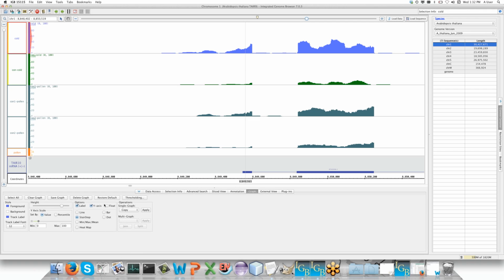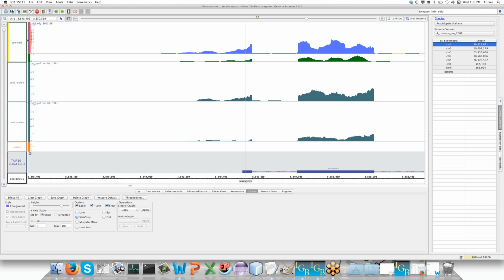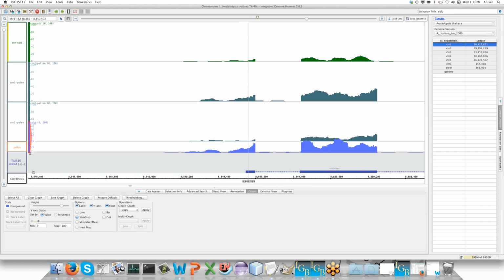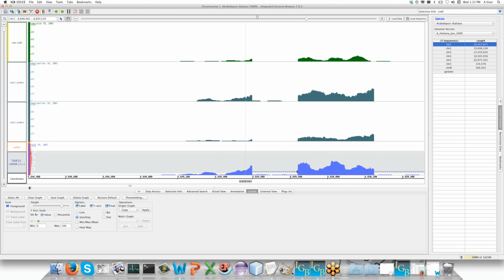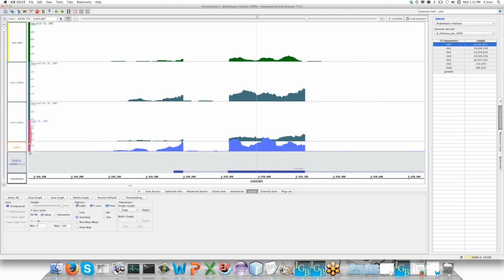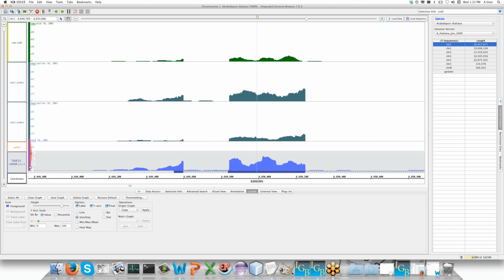We give you in IGB the ability to float a graph for almost this reason. Floating disengages the graph from the lockdown section and allows you to click and drag it so that you can either overlap it with other graphs or overlap it onto the annotation like this. In which case you can actually align it to the annotation and make sure it does or does not match as you like. Here we can show exactly where the edges are and where the edges of the reads are.